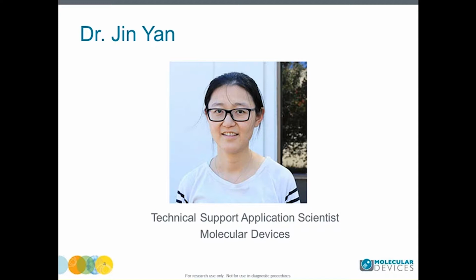Thanks, Jeff, for the introduction. I've been with Molecular Devices for a year and a half and have talked and emailed with a lot of our users. I noticed that there are several issues that have been raised a lot, and I would like to take this opportunity to discuss these functions with you. As you can see from our title, today we are going to cover three main topics: combine traces, calculate decay and rise time constant, and fit curves.